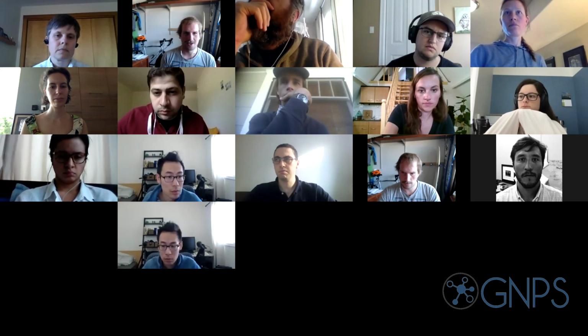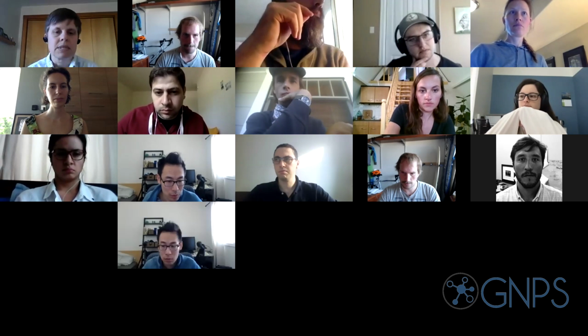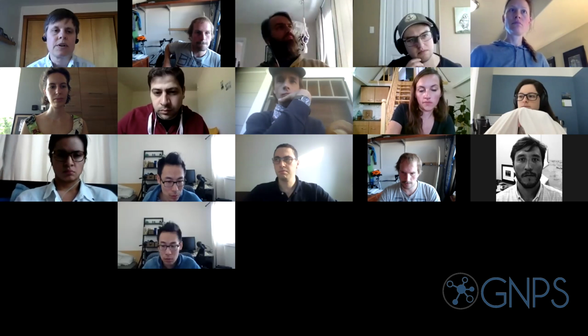I don't know, are you all familiar with fine isotopes? Yeah, I primarily have been using CAMERA and some of the stuff out of Formularity to do this, and I was just wondering how this compared to those two tools. So CAMERA does a very similar thing. Have you compared it directly? I'm just curious. We didn't really benchmark it. Okay. CAMERA is actually used in XCMS to do ion identity networking now. Yeah, so we interfaced it to existing modules such as CAMERA.